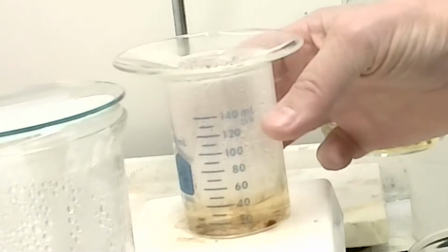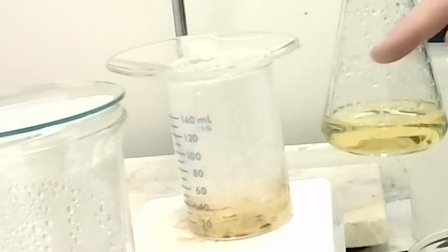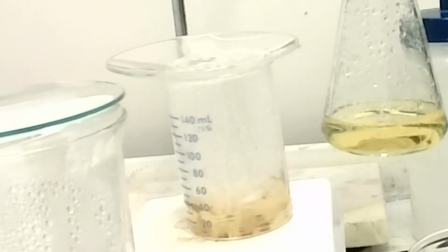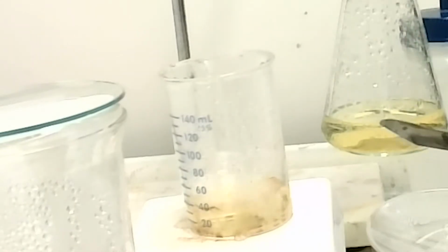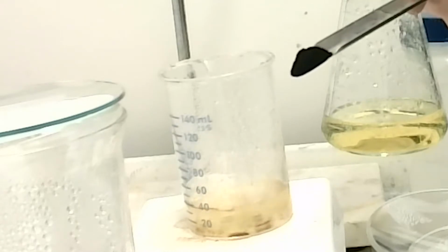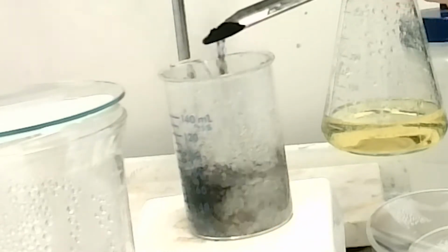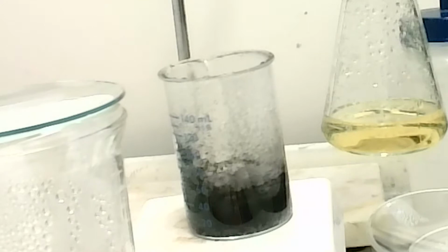We have basically dissolved our crude. You'll see droplets of color on the bottom. There's a little bit on the side, but we have to decolorize now. So we're going to take this activated charcoal. We're going to add just a small scoop, and what it's going to do is grab all the coloring compounds and hopefully leave behind in solution the acetanilide.